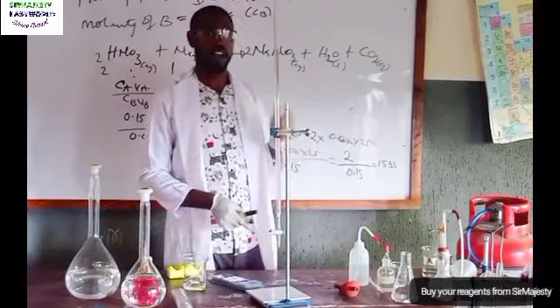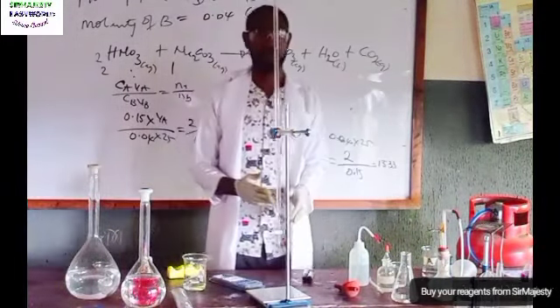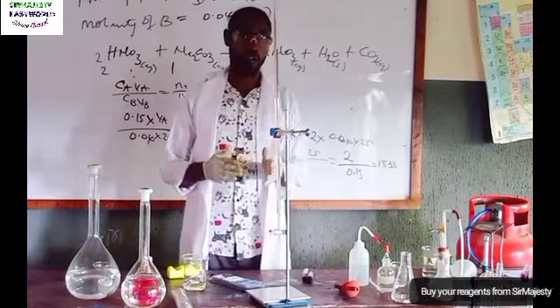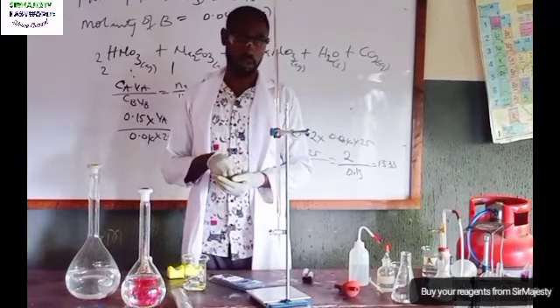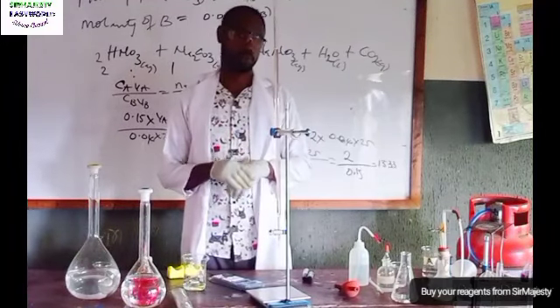If you use 25 cm3 of B, your endpoint range should start from, even if you use 12, you are still within the range. 12 to 18 should be accepted, but from my own titration, because I used 70% HNO3 and I have my accurate measurement, I got 13.5.